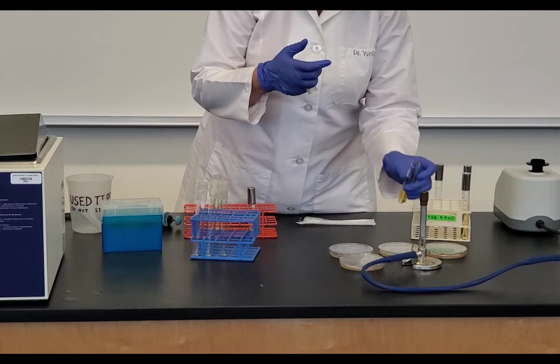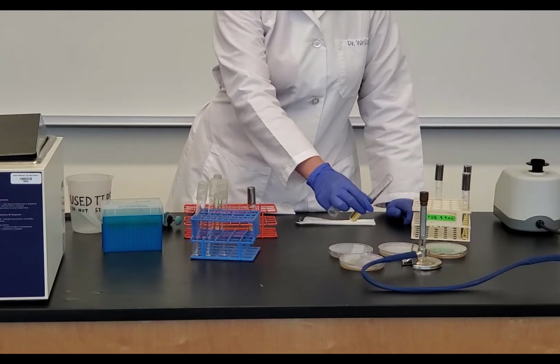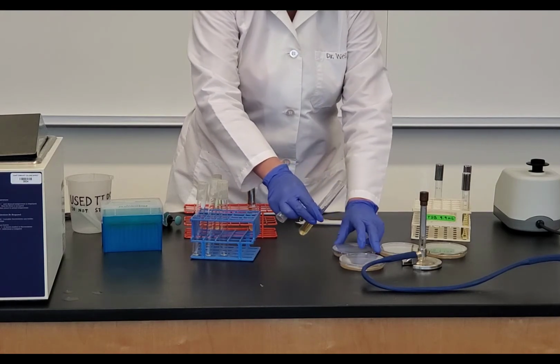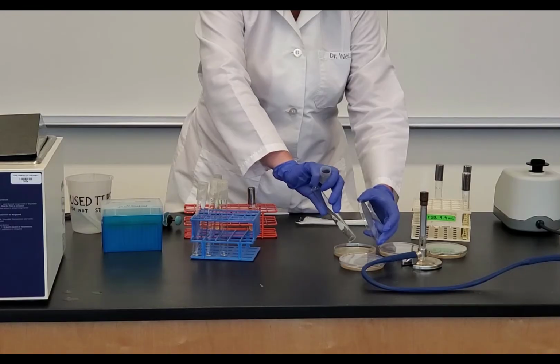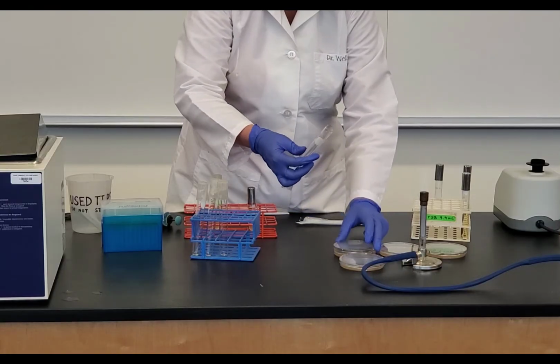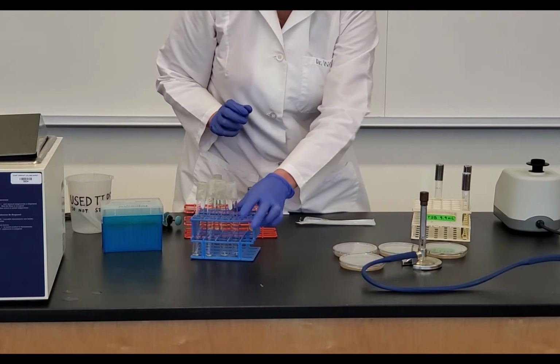And I'm going to flame the opening of this tube. And I'm going to let it cool for a minute, but close to the flame, because again, my flame is my sterile field. So I'm going to let it cool for just a minute, and then I'm ready to pour it. So I'm going to pour carefully onto that plate. Put the lid back on. Put the cap back on.